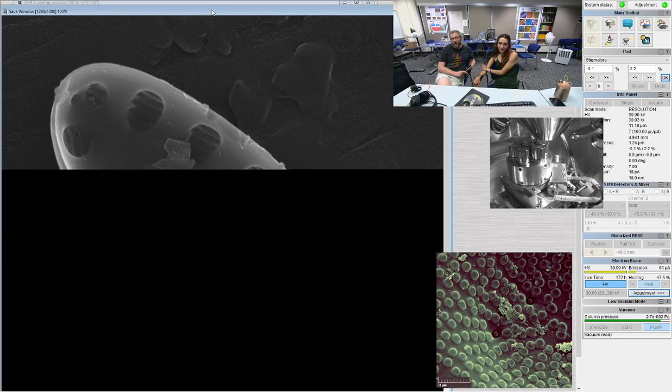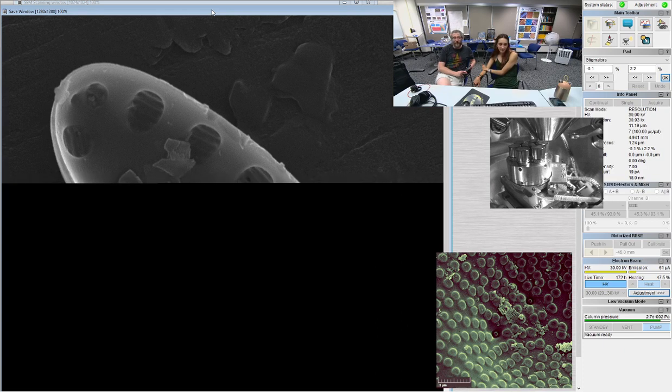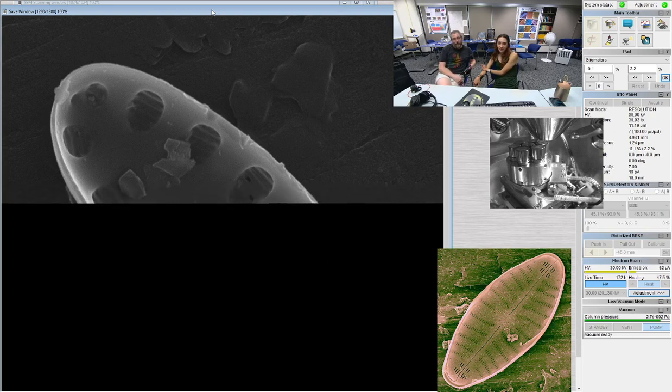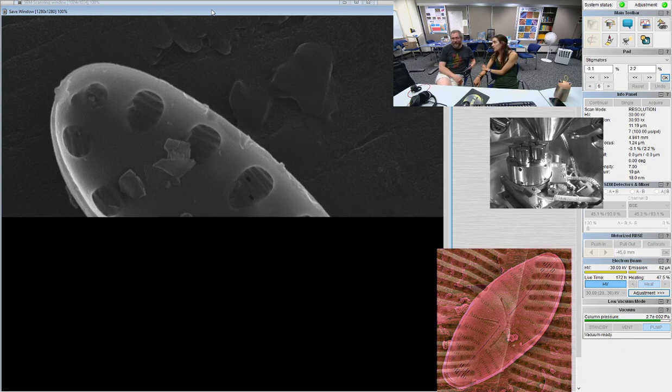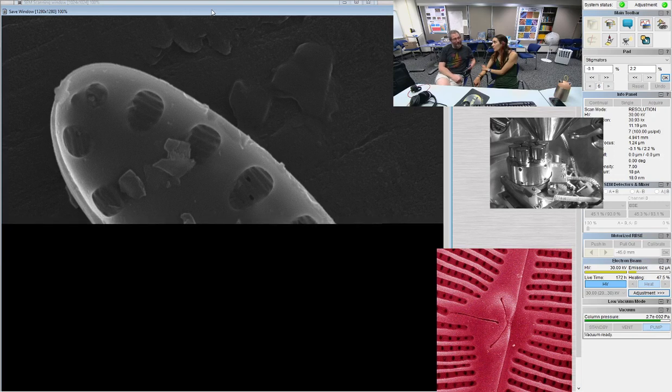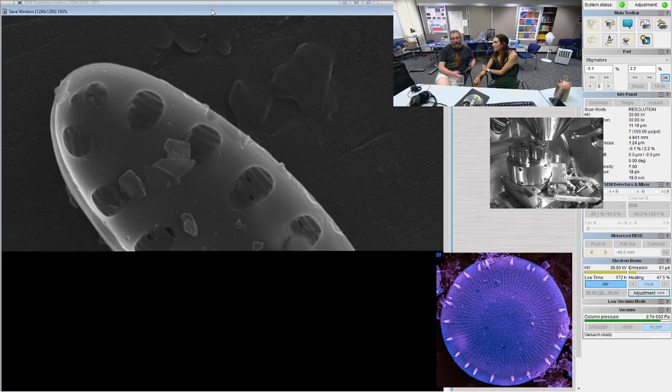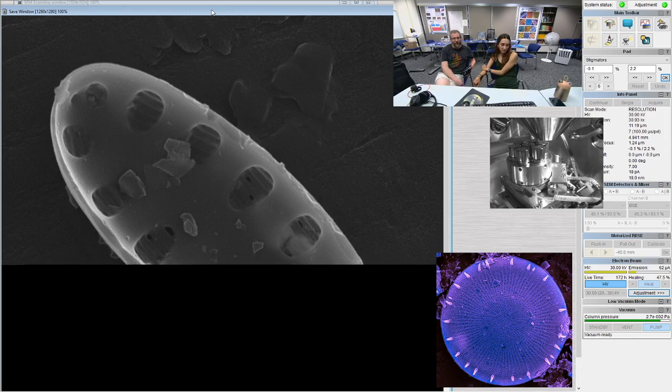And a lot of the diatom samples I looked at had like 95% the same thing. Oh my god, okay. So it made it pretty easy to count the first like 300. And then there was some in the middle there that were also very low diversity. But so this was just one core? Mm-hmm. 13,000 years, 2,000 samples. Of where? Foy Lake in Montana. Oh my god, how deep is this lake? About 35 meters, and then we got 15 meters of core out of it. So we were down like 50 meters into the water.